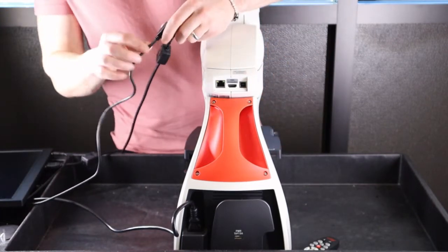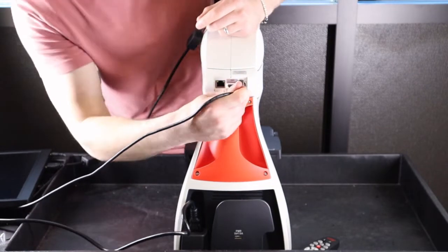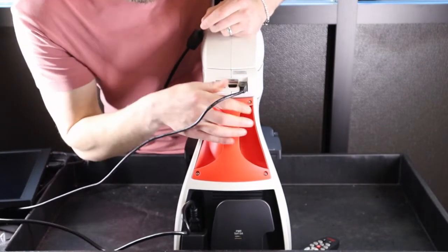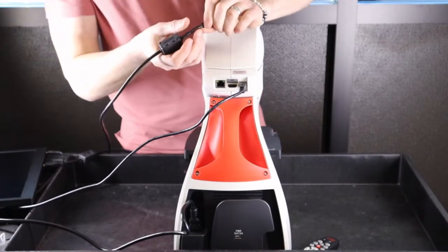To power the camera, take the USB cable and plug it into the USB port. Take the other end, plug it into the wall adapter, and plug it into an outlet for power.